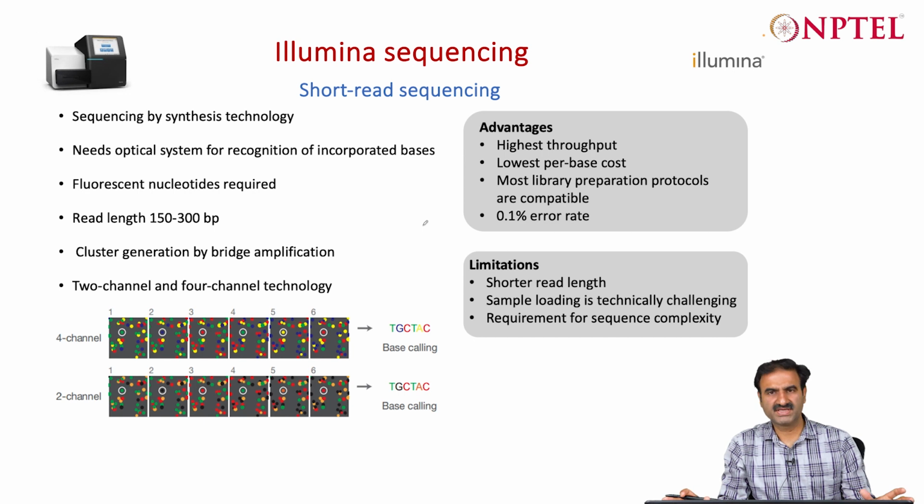Okay, so just to brush up the previous things, basically the gene sequencing of either the RNA transcripts or the DNA. Illumina is one of the preferred technologies because it produces high quality reads, although they are short, but these days the assembly methods have also improved. And they also act as error correctors for the long read sequencing.